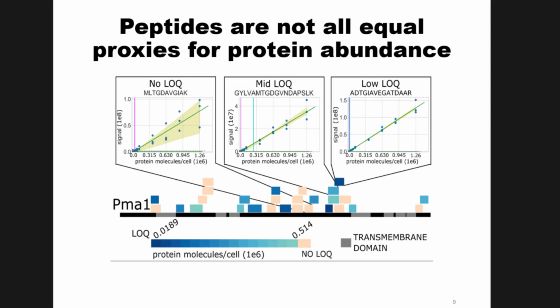No. I can just have on the x-axis x, 2x, 4x, and so on. Yep, you could just do a fractional dilution and say my highest point is 100%, and then I've fractionally diluted it down to 0% of my crude in the sample. But Sue's totally got you covered. I think we have a whole lecture just on calibration curves because they're kind of difficult to grasp.